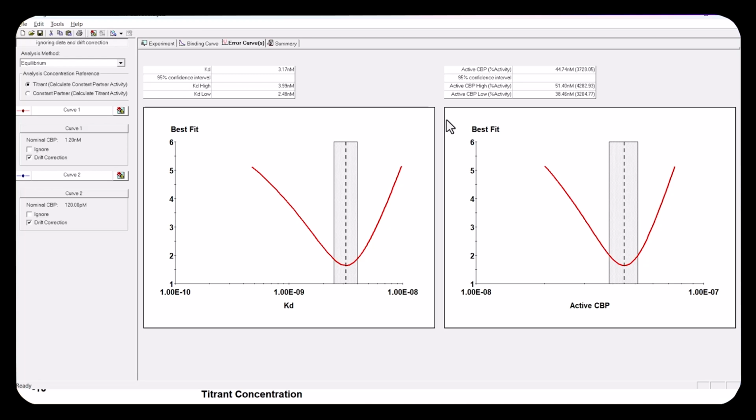I just reject that out of hand. I don't believe it. It's easy for me to wave my hands and say, okay, you haven't done as good a job of purifying as you think, or some of your protein is misfolded. It's all there, okay, but not all of it's active. So I can accept pretty much any number less than 100%, but numbers that are greater than 100%, especially numbers where the confidence intervals are well over 100%, 320, so at least 320-fold extra. No, I just don't believe it. Or 32-fold extra. No, I just don't think that's right.